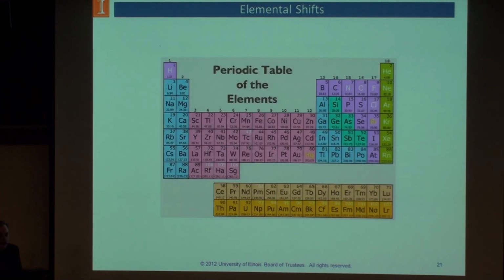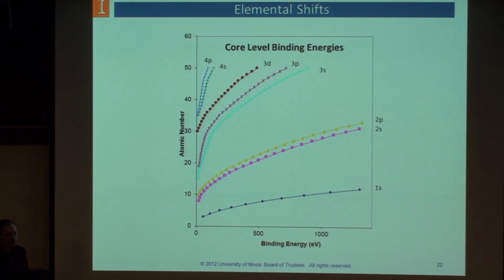And in general, along a certain set of orbitals, the binding energies will increase, with functions similar to this. So you'll see for the lighter elements, we'll look at some of the deeper orbitals, the 1s. And you'll see that we don't have to go very far up in atomic number before we get to a point where we don't have enough X-ray energy to excite those. But that's okay, we'll then move to another orbital, and eventually for the heavier elements, we'll start looking at the outermost orbitals.